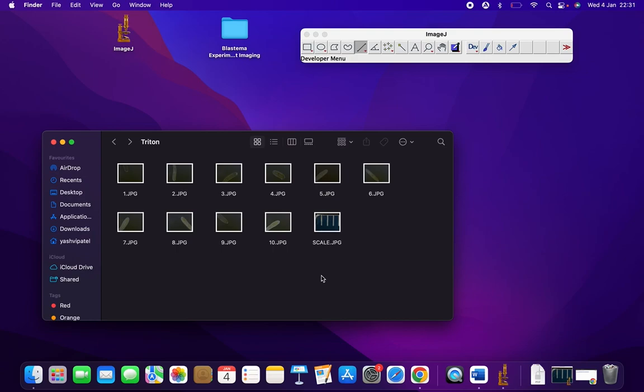In this video we are going to see how to calculate the blastema area using ImageJ. These are the four images. Ensure that you reset the scale in ImageJ using the image of the scale taken on that day.